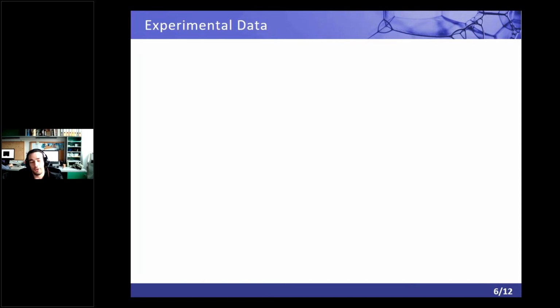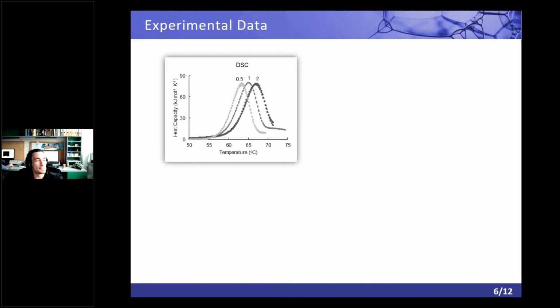So people, labs all over the world, usually use much simpler methods. For instance, differential scanning calorimetry. Here on the left, the machine records the heat flow to a sample. You take a protein, put it in a cuvette, and then start increasing the temperature by 1 degree Celsius, for instance, and measure how much energy it consumes.